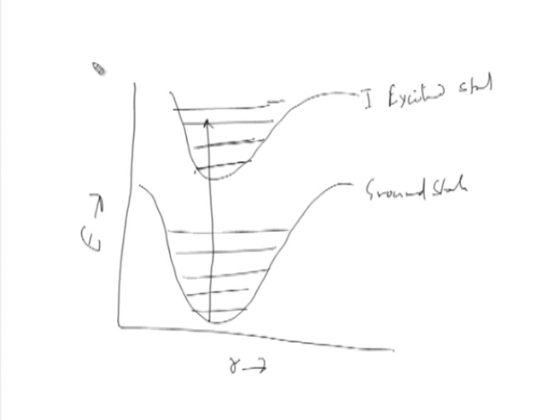Now, in absorbance this will be a different thing, but in fluorescence what happens is the excited electron will first fall through these vibrational levels here, and then it will come down to a particular vibrational level in the ground state, but it comes to a different level where there is emission of certain photons, a phenomenon known as fluorescence. All right. So, in very simple terms we have tried to understand the phenomenon of fluorescence.